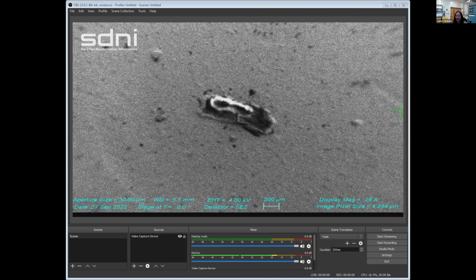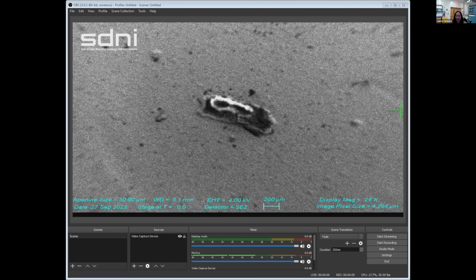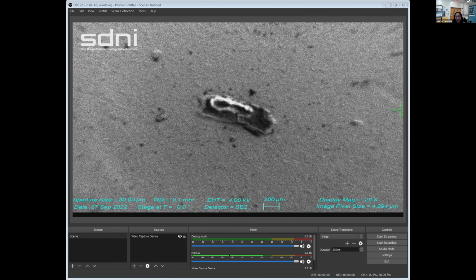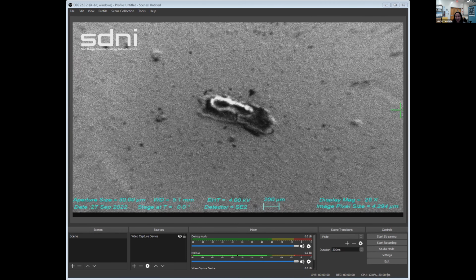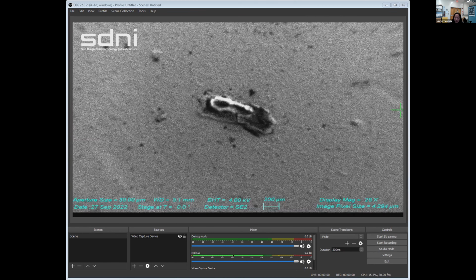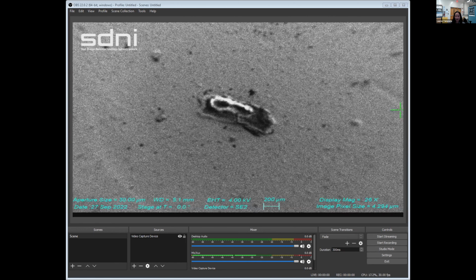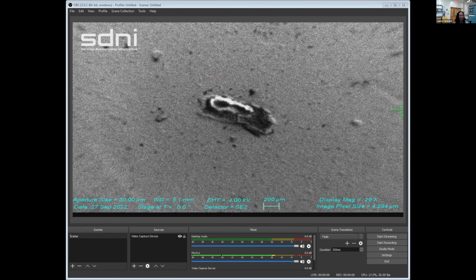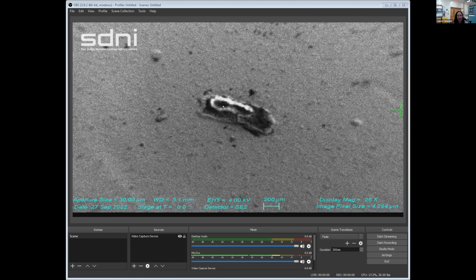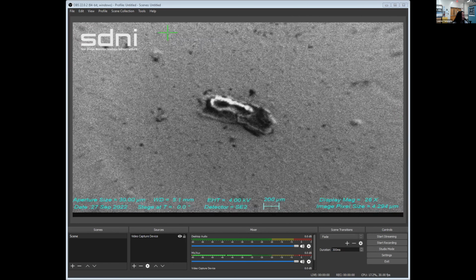There was some fighting between scientists from different institutions about what makes these geckos stick. Is it water-based forces like capillary adhesion, or is it intermolecular forces like van der Waals forces? Before I give you the answer to that, we will check out this image over here.